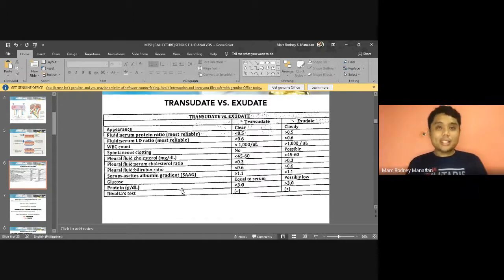All right, take note. Because again, remember that there are many cells, right, and increased permeability of your capillaries. Okay, so therefore, cells, proteins, solutes, whatever, leak out. So that's why it's cloudy.